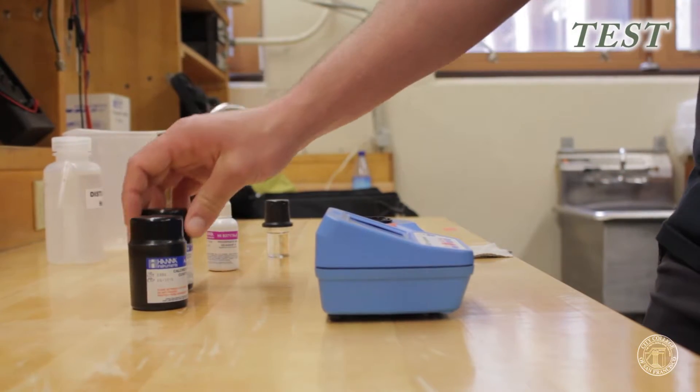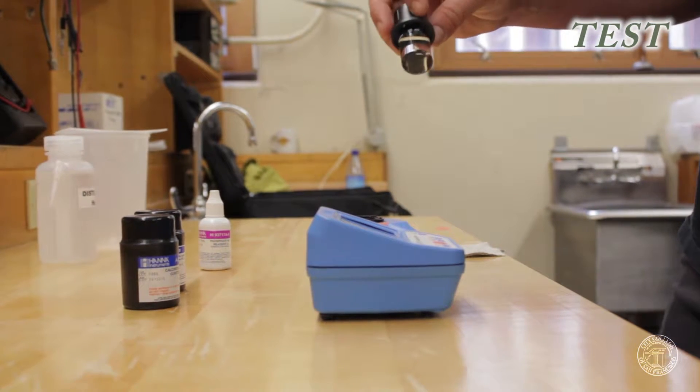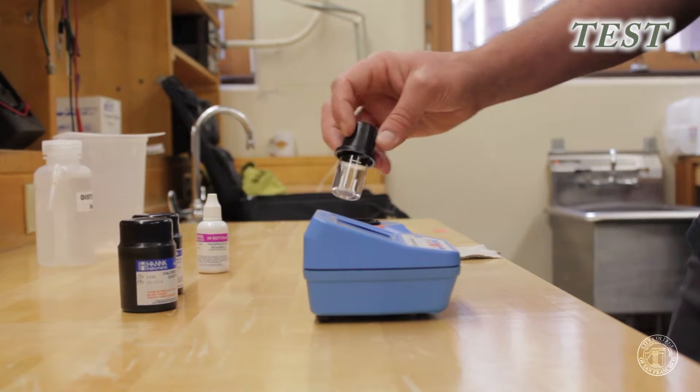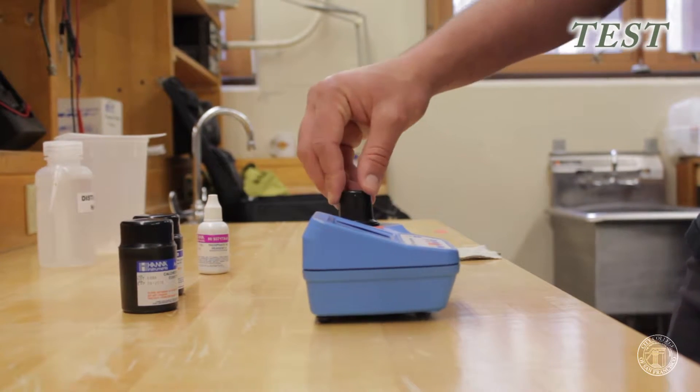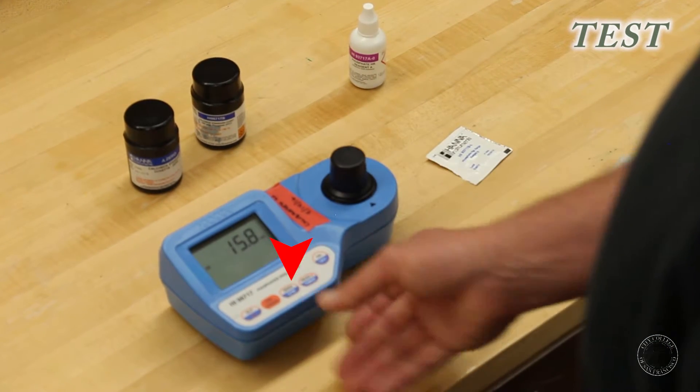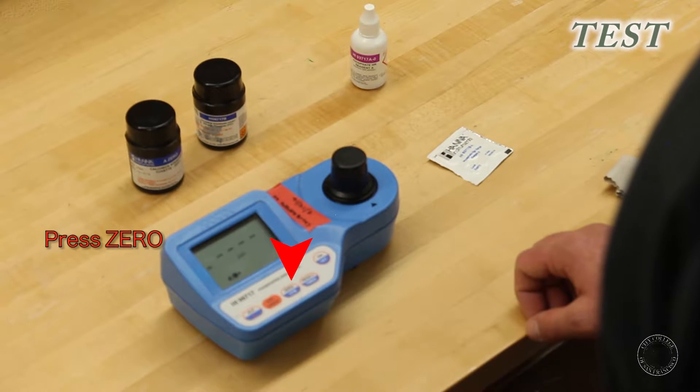To take a reading, we'll take our sample cuvette filled with 10 milliliters of unreacted water. This is just local tap water here. So we'll put that in. And every time you have a new sample, you want to take your sample and zero it out before you add your reagents. So we'll put the sample in and push zero.